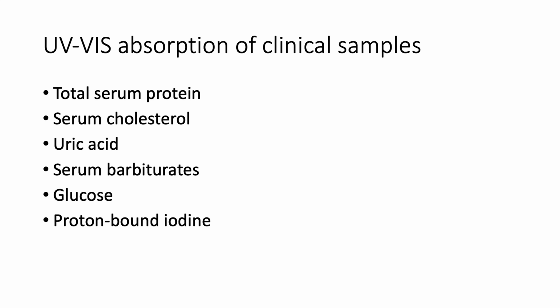These are all in a biological or clinical setting. It's also used in a lot of industrial applications. It's used in pharmaceuticals, drugs, in the food industry, the paint industry, glass, making glass or metals. It's also used in, I mentioned forensic applications before. There are also other kinds, for instance, to analyze narcotics.